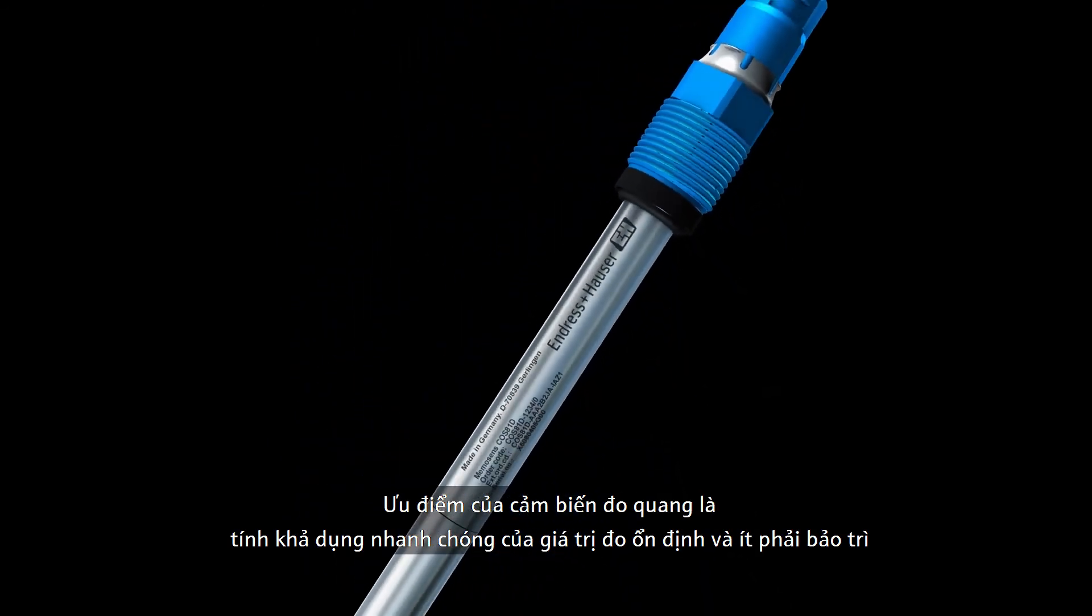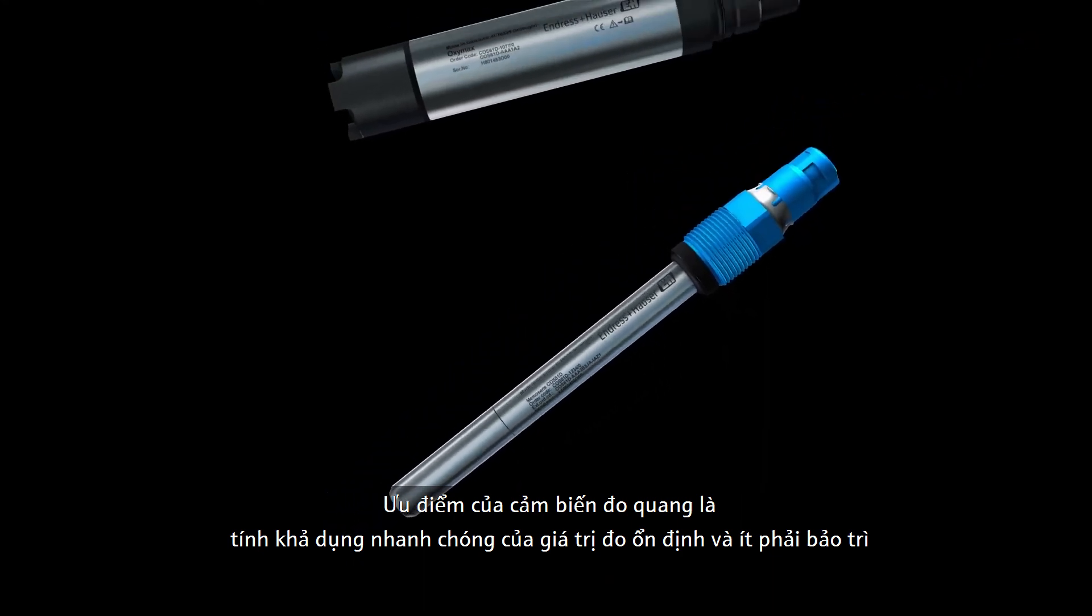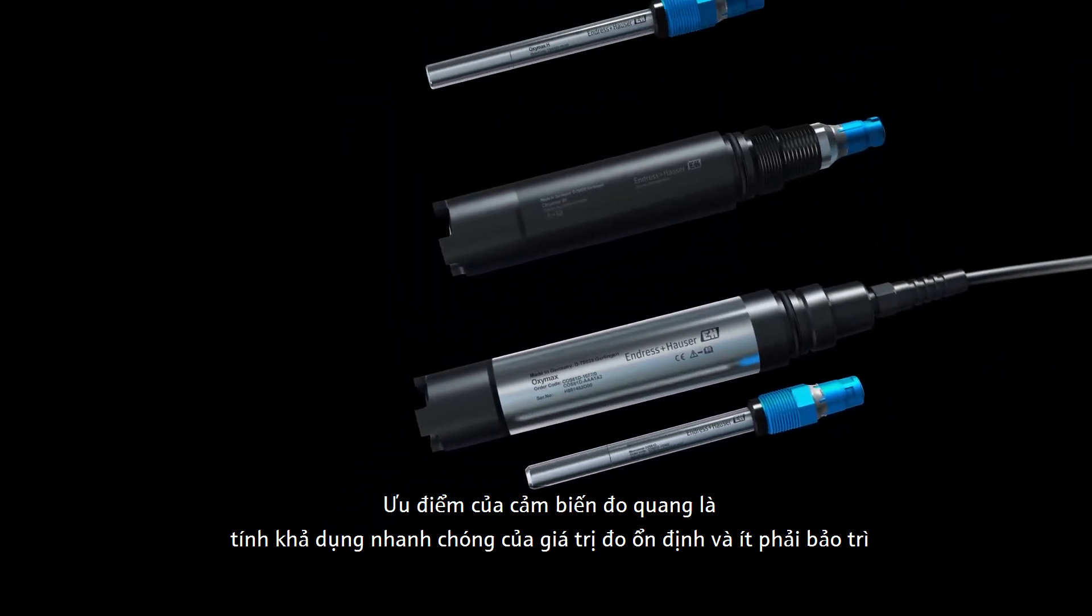The advantage of optical oxygen measurement is fast availability of stable measured values and extremely low maintenance.